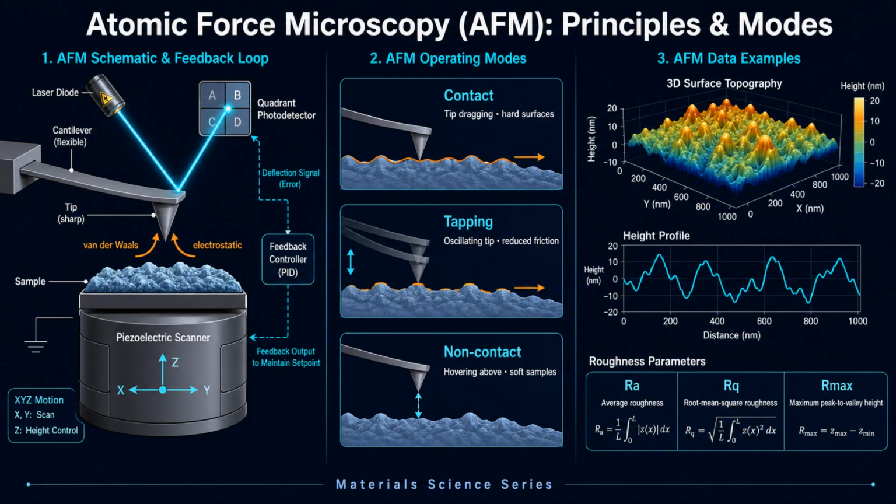Beyond topography, AFM can measure mechanical properties like stiffness through force spectroscopy. It works on various substrates and doesn't require vacuum.